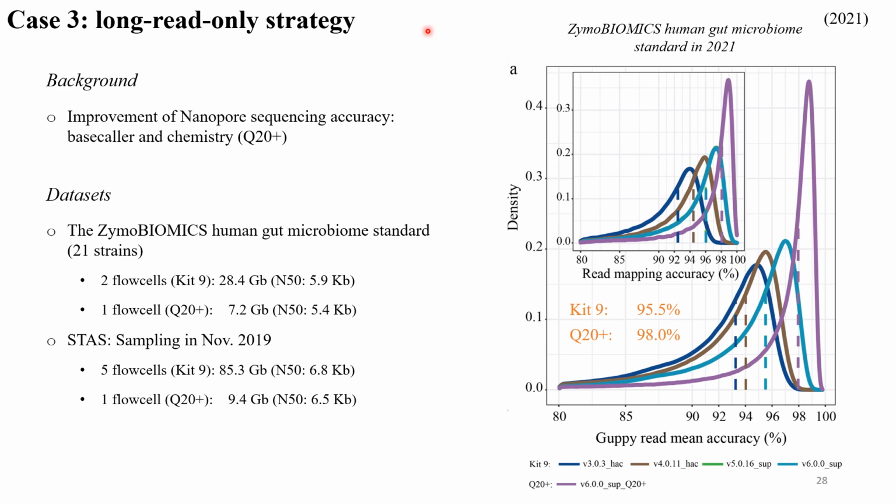The primary concern in the application of nanopore sequencing earlier is the high sequencing error rate. As I mentioned before, the median sequencing accuracy was below 90% in 2019. So in my first two cases, we used the hybrid strategy. The short read sequencing should be included.